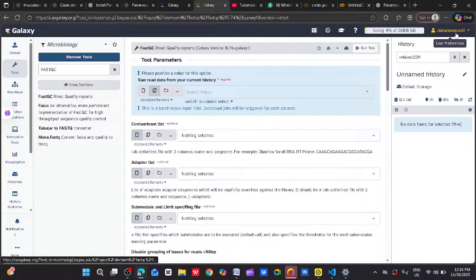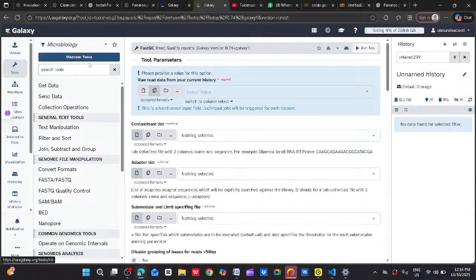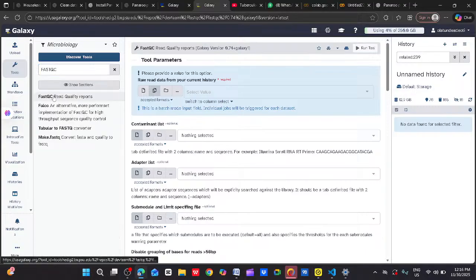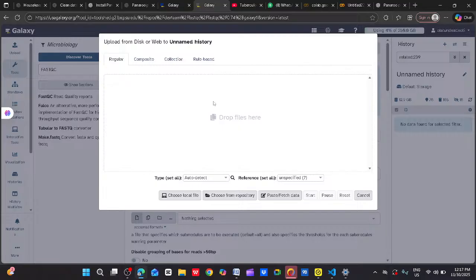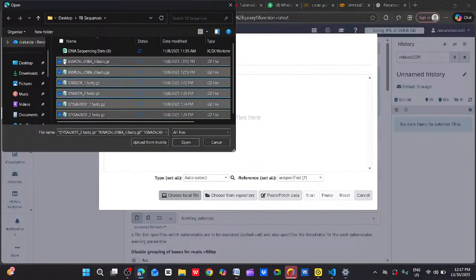So check again, this is Adeoto Olatunde. Okay. So FastQC, always check this. This one is under tools, FastQC. After that, click on multiple datasets, then upload. Okay. File, choose local file. Then these are the sequences, six. Okay, 1 2, 1 2, 1 2.